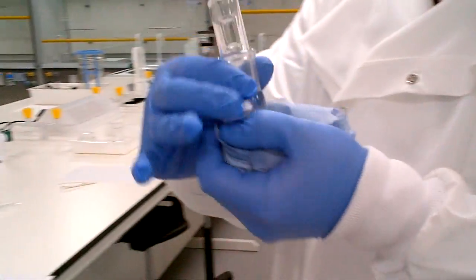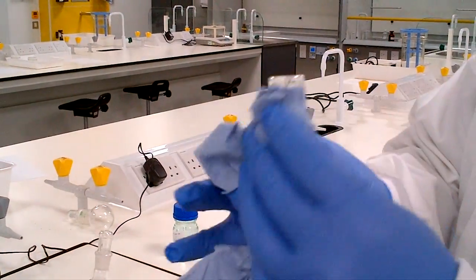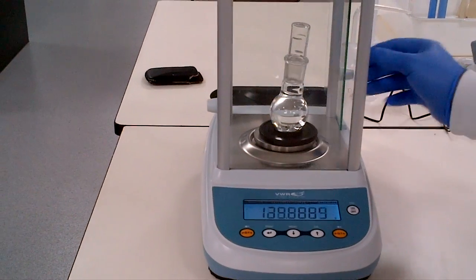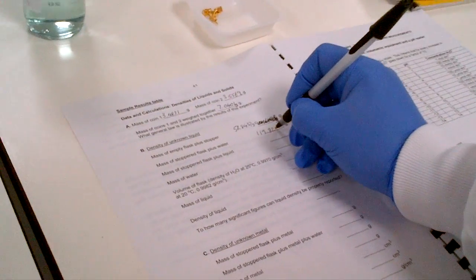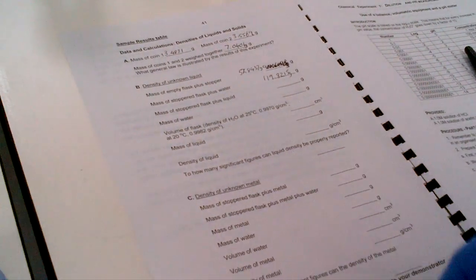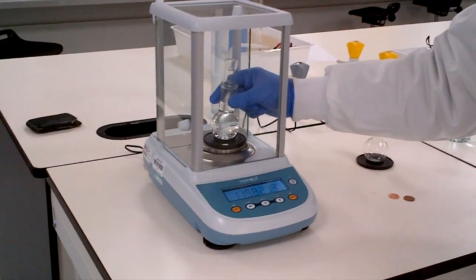Give it some wipe, remove any residual water from the outside of the flask. Back towards the balance area, place it on. So you've now got a mass of flask of 119.8215 grams. So then we now need to take the unknown liquid into here.